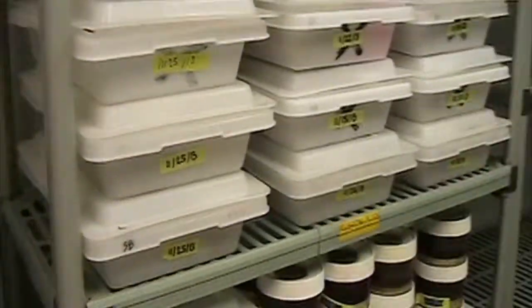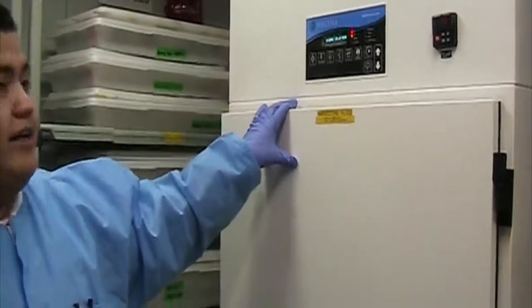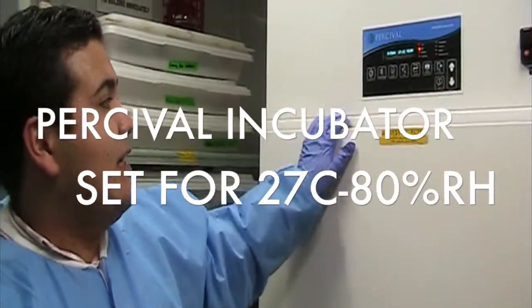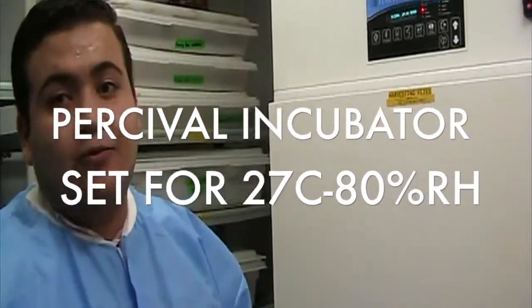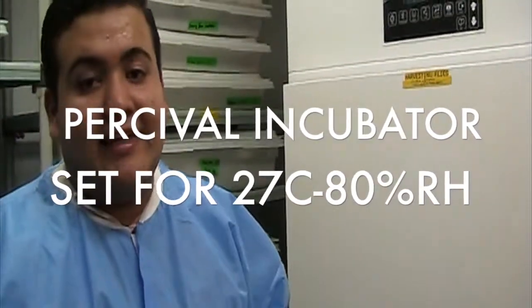Let me show you this incubator. This is a Percival incubator, basically kept at 27.1 degrees Celsius and around 92% humidity. It's a little bit warmer than the room because we need the humidity to be higher so the flies can lay their eggs. I'm going to open up the incubator for you.